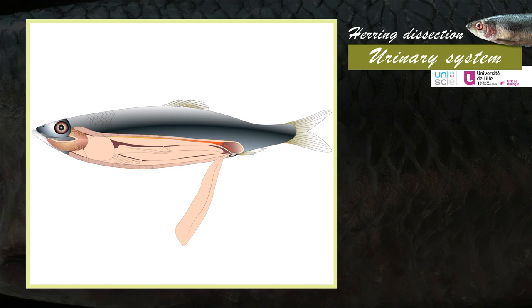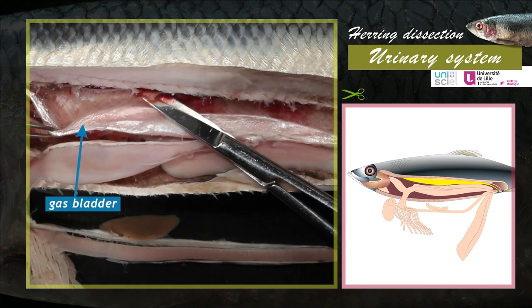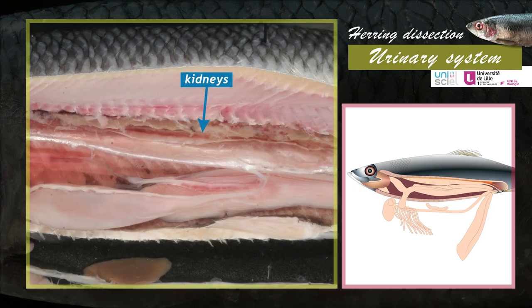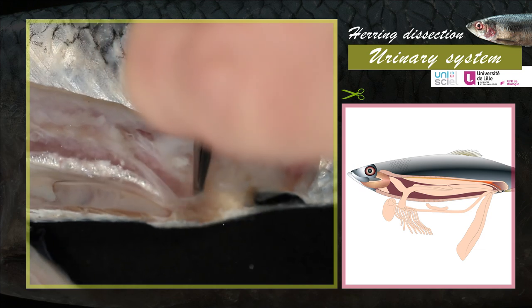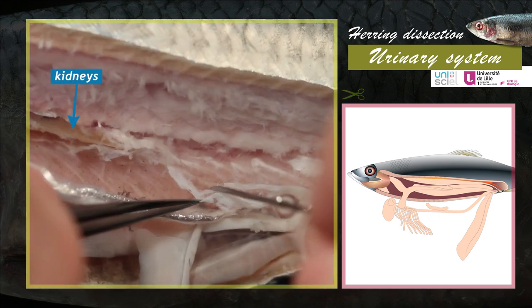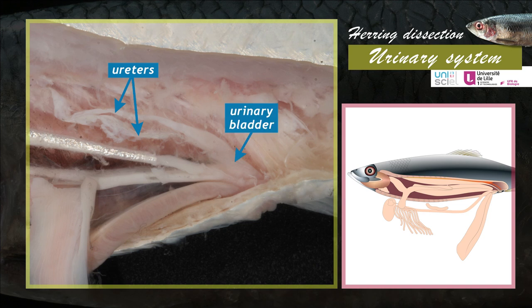The urinary system is located on the dorsal side beneath the spine. It is composed of the kidneys and the excretory ducts. Nitrogenous waste is excreted in the form of ammonia. To see the kidneys, move the gas bladder down and cut the tissue that covers the kidneys with scissors. The kidneys are two elongated masses that fuse on the median plane. They continue towards the back of the animal with two ureters that must be isolated with caution, starting from the anal and urogenital papilla and going up to the kidneys. In their posterior parts, the ureters fuse into a urinary bladder, which leads to the anal and urogenital papilla.